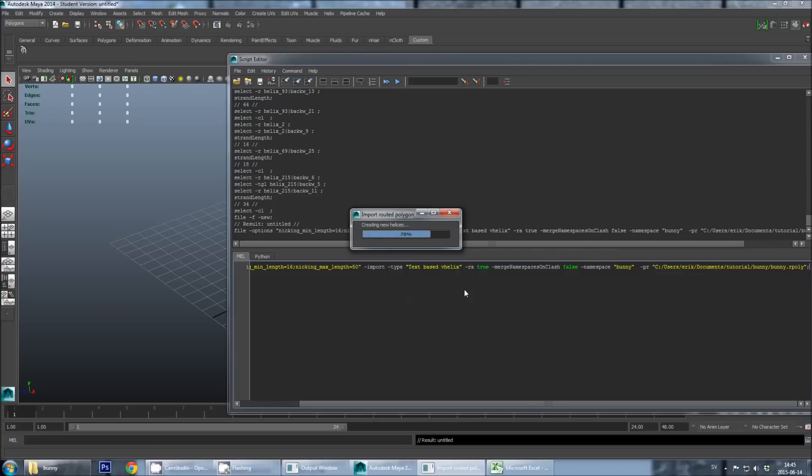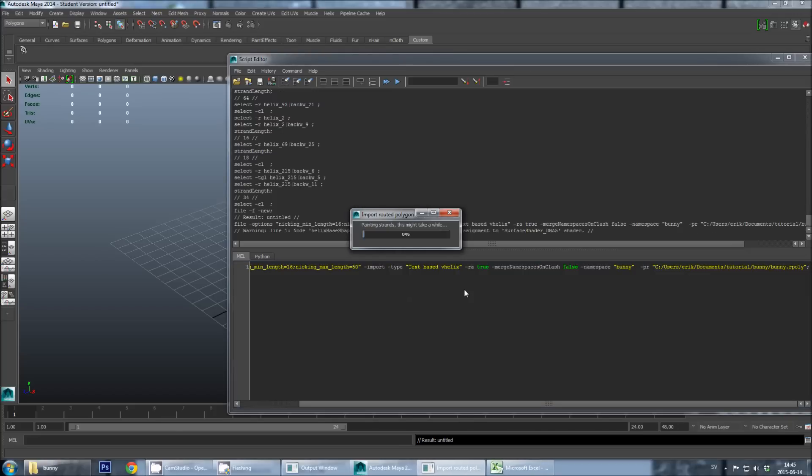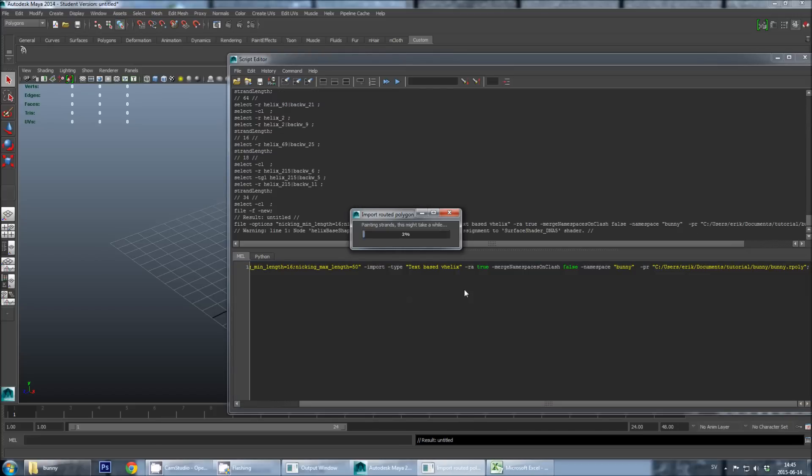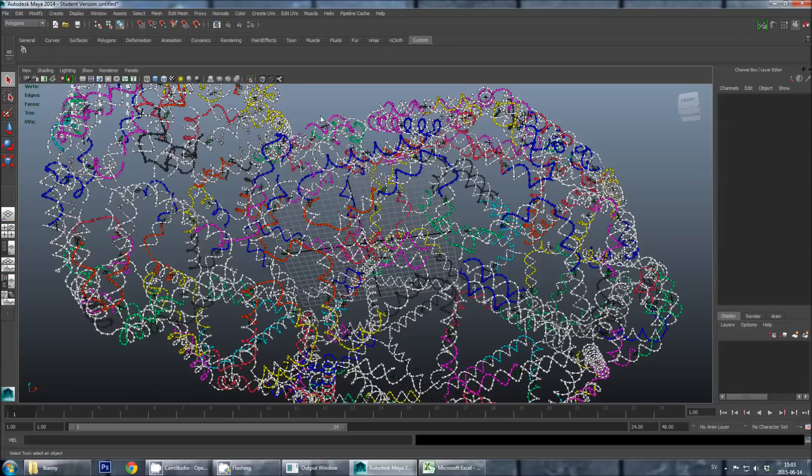And this will again bring up the V-Helix importer, which can take a few minutes. Okay so now the import has finished again.